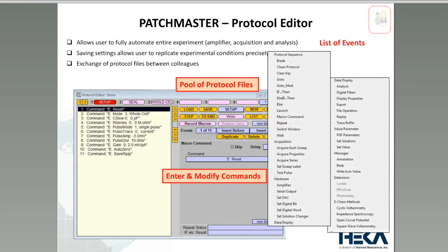And when you press it, then a list of events will pop up. And this list of events is huge. And I would recommend, for example, when you're in the learning phase, just learn one command at a time. And when you understand it completely, then go on to the next one, or use only the ones that you really need. And this is how you make your way through this list of events.